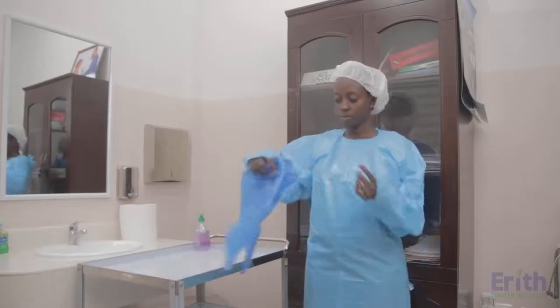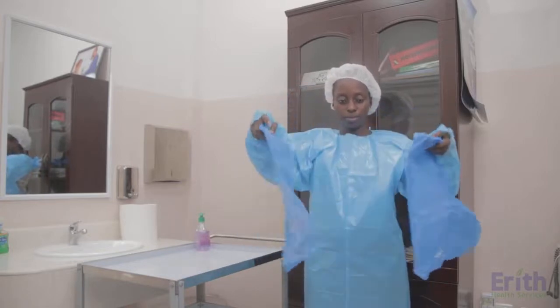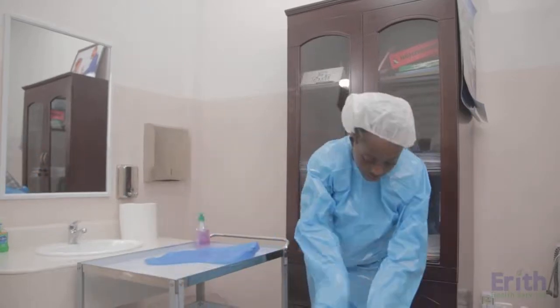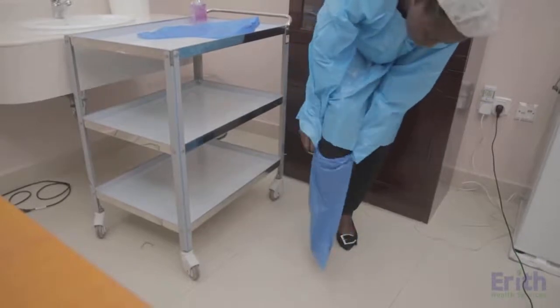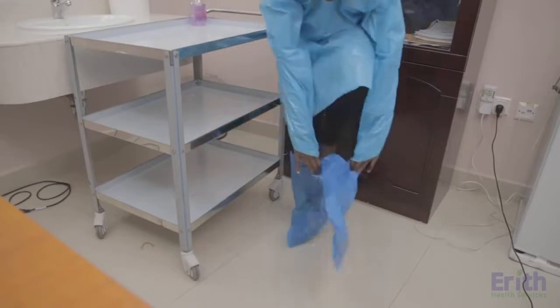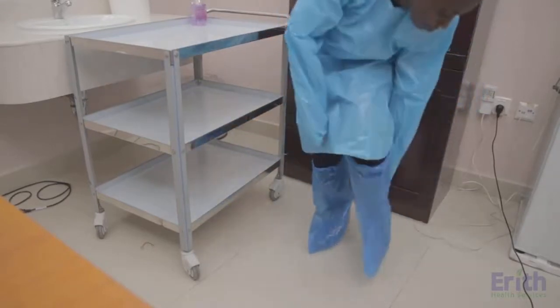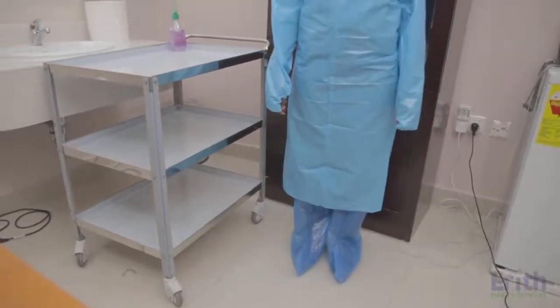Leg protection. Wear leg protection whenever there is the potential of the legs coming into contact with blood, body fluids, or other contaminated materials. Examples of protections are boots, clogs, overshoes. Note, do not wear open shoes in procedure areas.